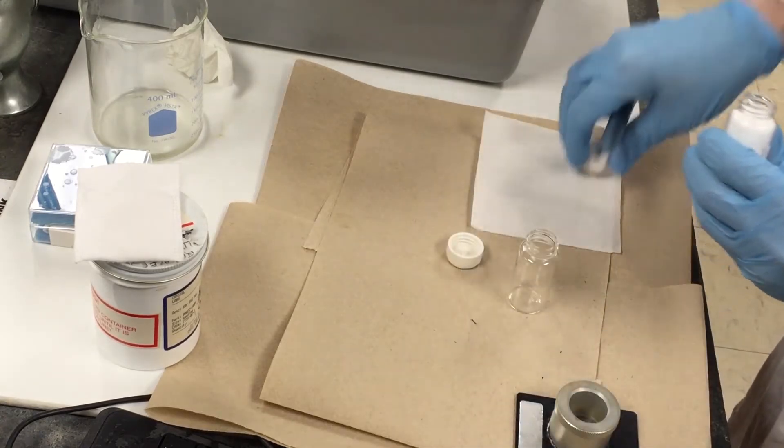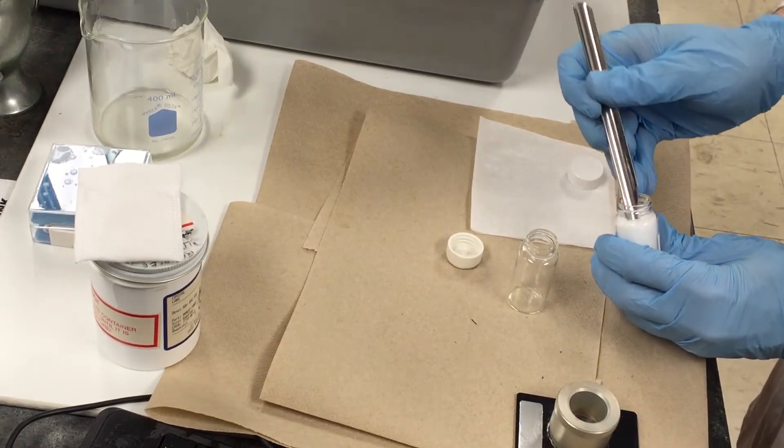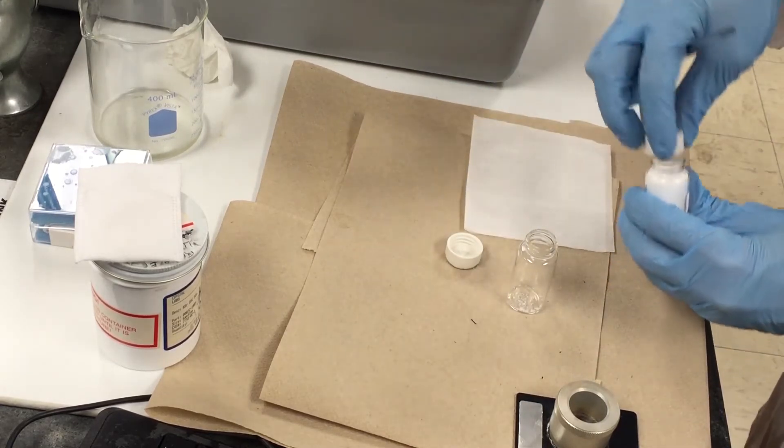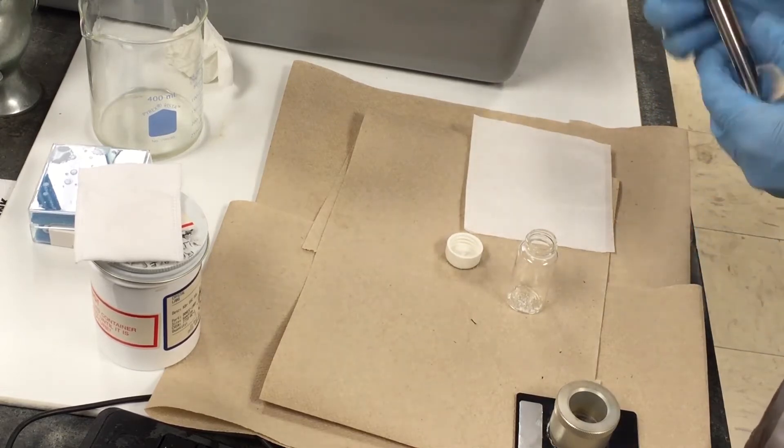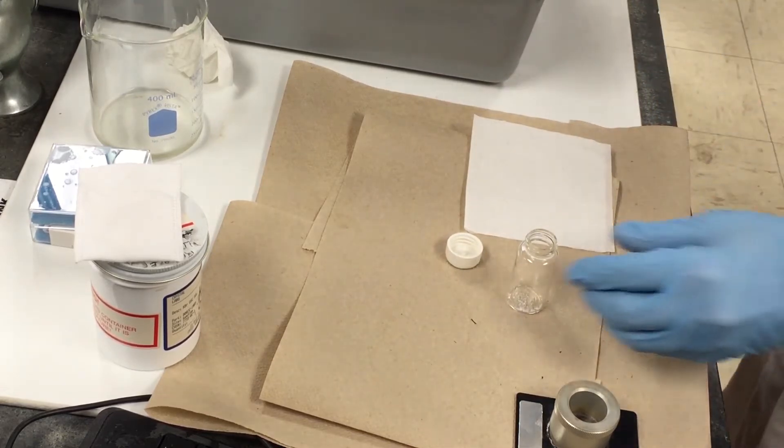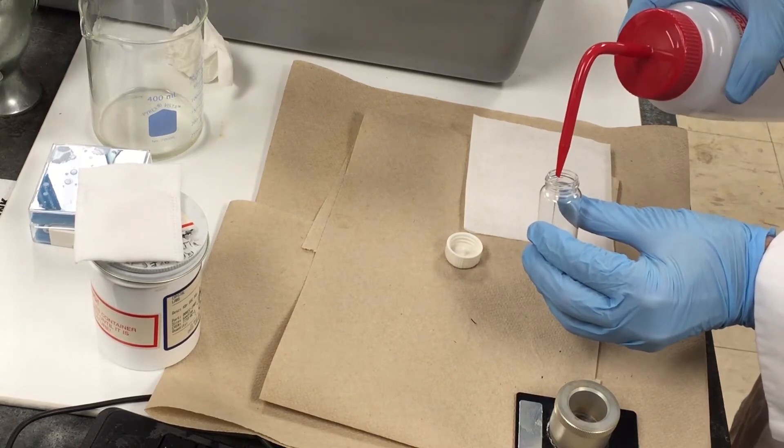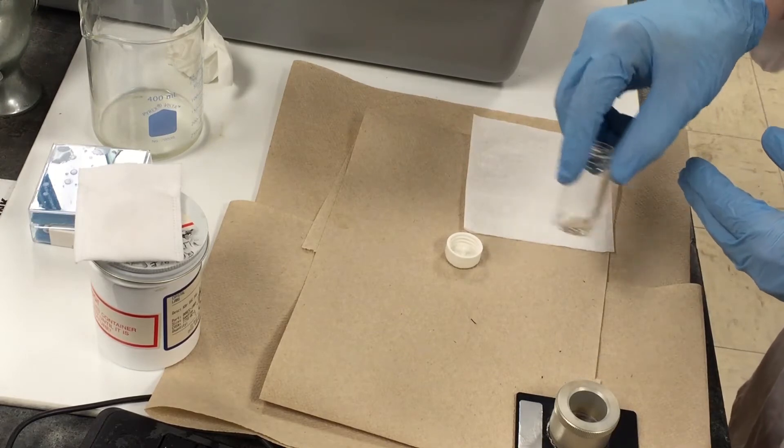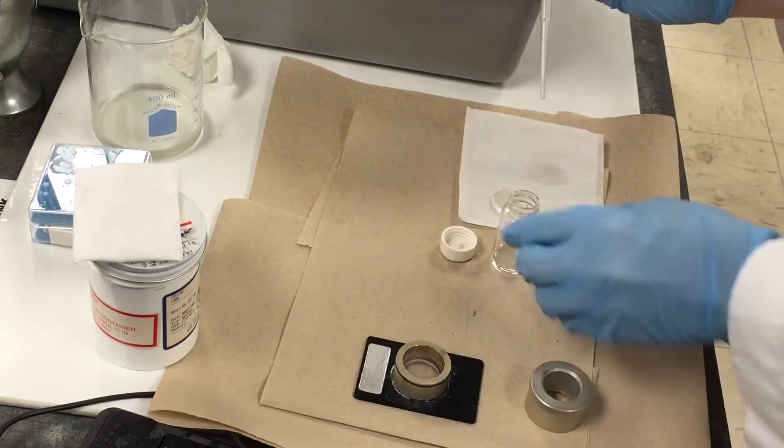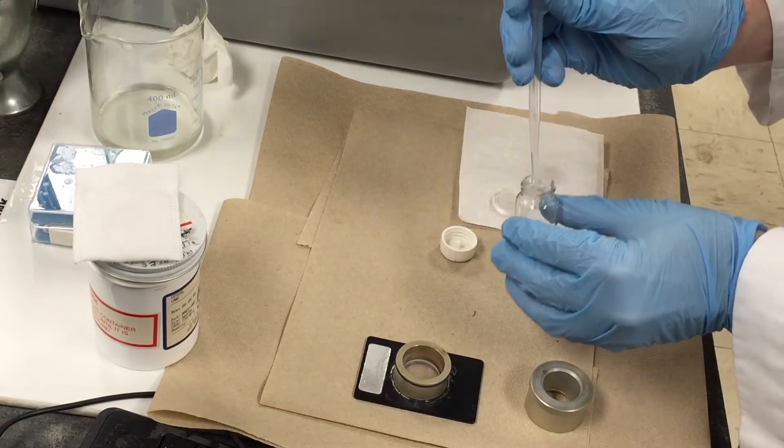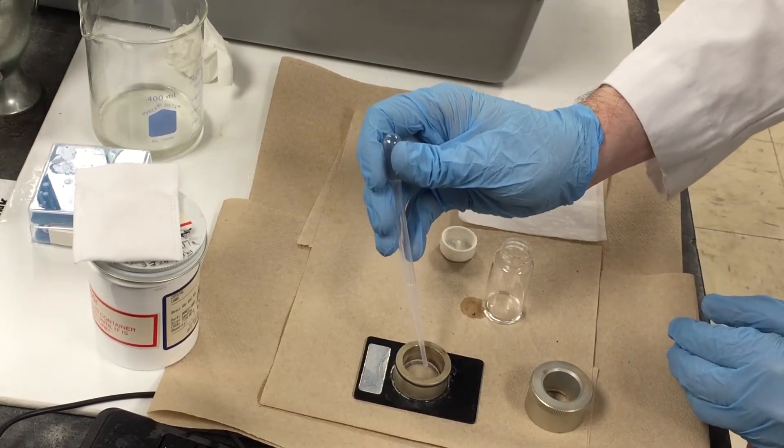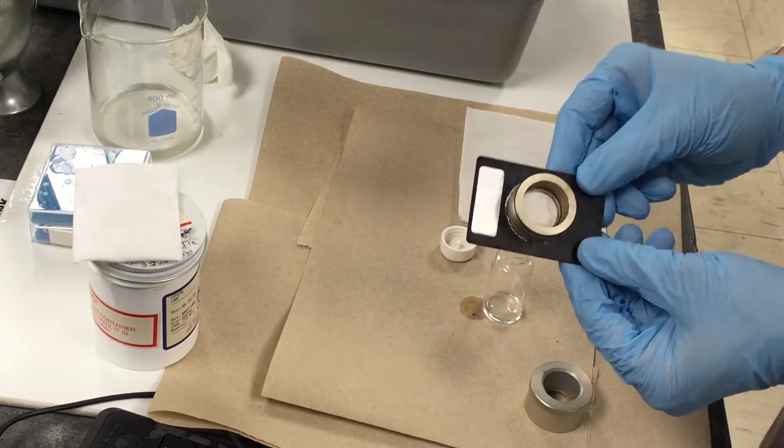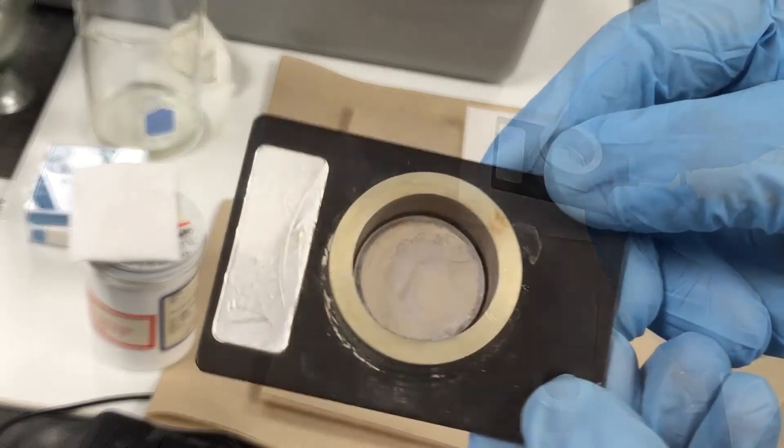Solid samples need to be dissolved in a volatile solvent first. In this case, we're sure the solid dissolves in acetone. Let the acetone evaporate completely, leaving a thin film of the solid.